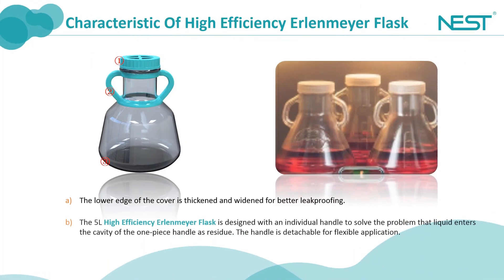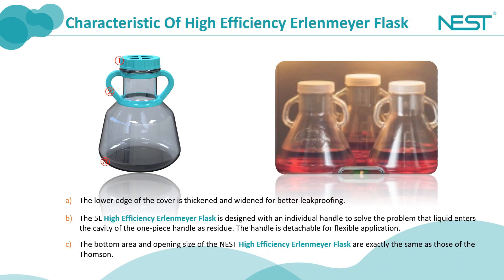The cover of Nest's flask can be screwed or unscrewed smoothly. The lower edge of the cover is thickened and widened for better leak-proofing. The 5L high-efficiency Erlenmeyer flask is designed with an individual handle to solve the problem of liquid entering the cavity of a one-piece handle as residue. The handle is detachable for flexible application. The bottom area and opening size of Nest high-efficiency Erlenmeyer flasks are exactly the same as those of S. Thompson ones, so a lot of verification work can be reduced, or even a seamless replacement is possible.